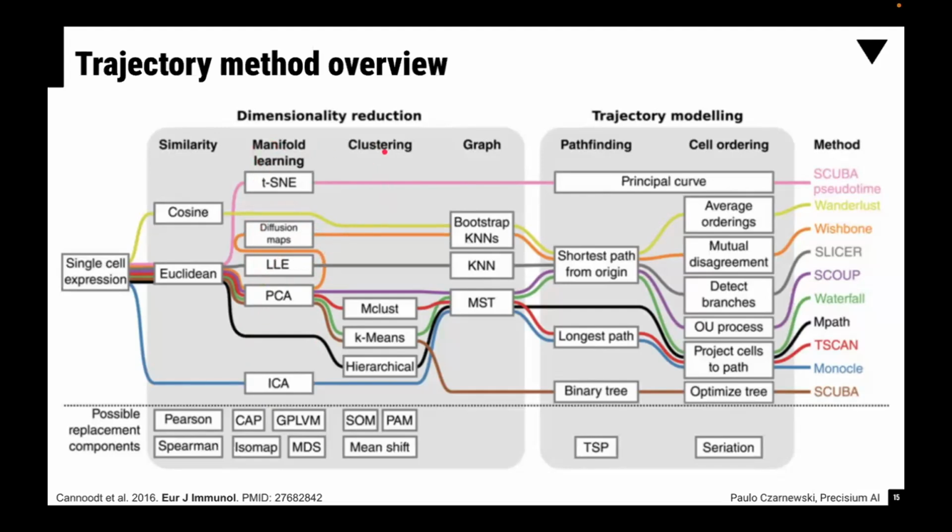Following that, you'll do clustering, which you have already done. You already have the harmony embedding, or whatever Scanorama embedding and so on, so this part is already done. You can then choose the clustering. For example, you could use the Seurat clusters or the clusters from the graph clustering on ScanPy, which I don't know if it's still Louvain, right? I think it's Leiden. Exactly. So you use those clusterings, and from those you can then create your connecting graphs.